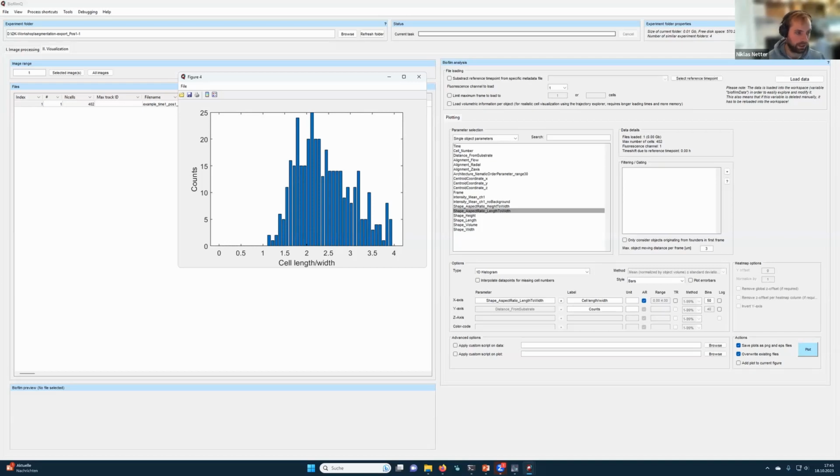So yeah, it's correct that StarDist assumes that the objects are star-convex. This is a very big bound already on what objects can be detected, because they have to be in a way convex. However, we have used here StarDist OPP as an additional post-processing step that also allows to segment cells that are not convex, but somewhat curved. This is something we developed especially for Vibrio cholerae biofilms, because with StarDist alone, we were not able to segment cells perfectly, because the cells are curved, and with StarDist alone, this curvature could not be captured in the segmentation.